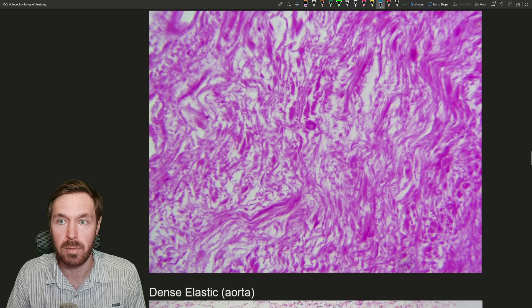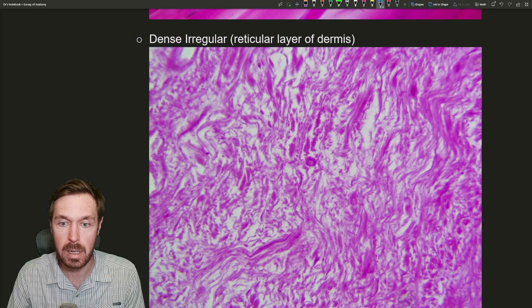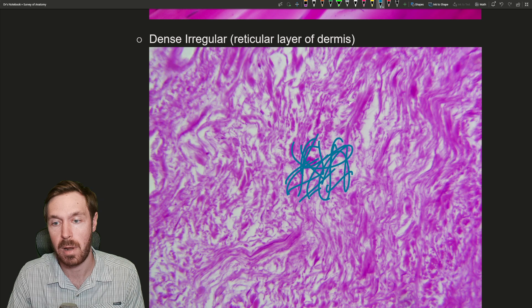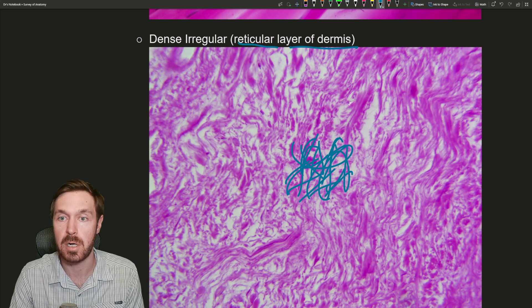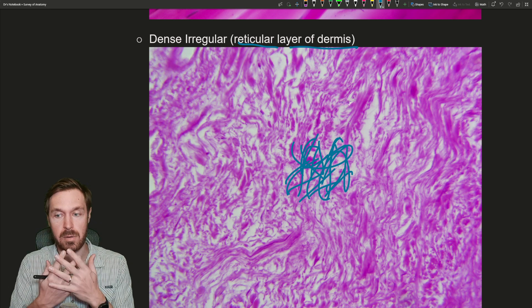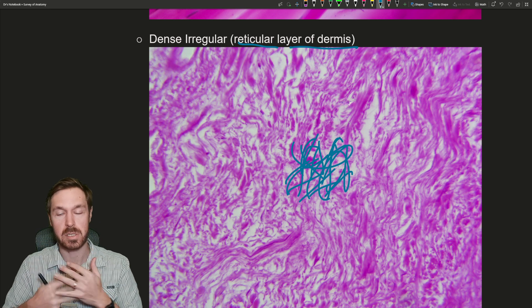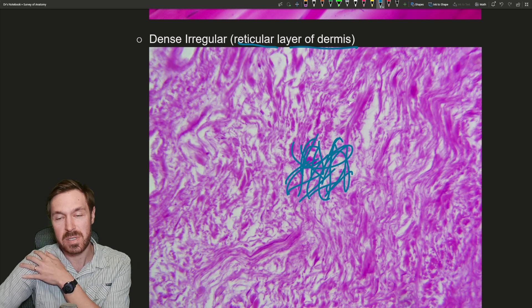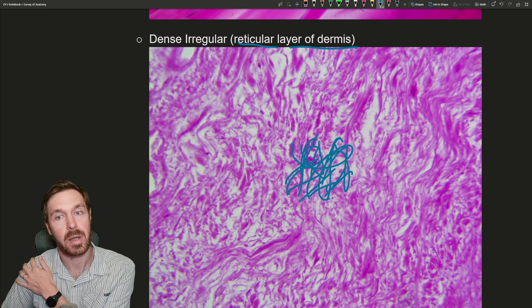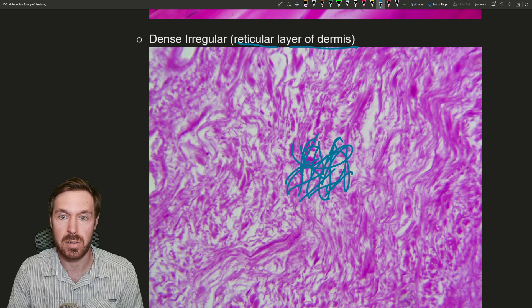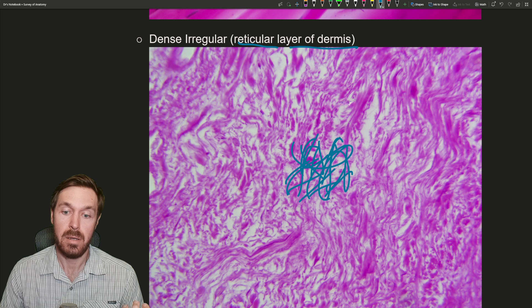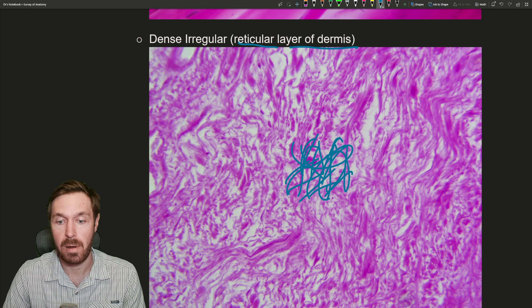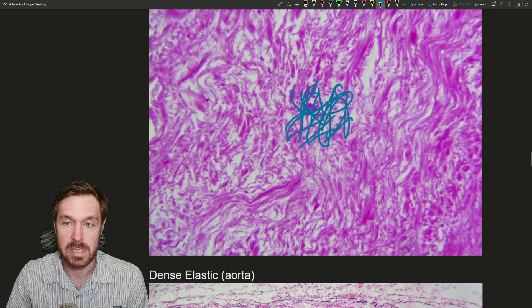Then we have dense irregular, where the fibers run in irregular directions. Here all these fibers are running in different directions — this is the reticular layer of the dermis. It resists pull from multiple directions. Your joint capsules around synovial joints, like your shoulder where you're twisting multiple ways, also have this dense irregular connective tissue. Collagen is one of the stronger proteins in the body with very high tensile strength, and how it lines up determines how it resists tension.